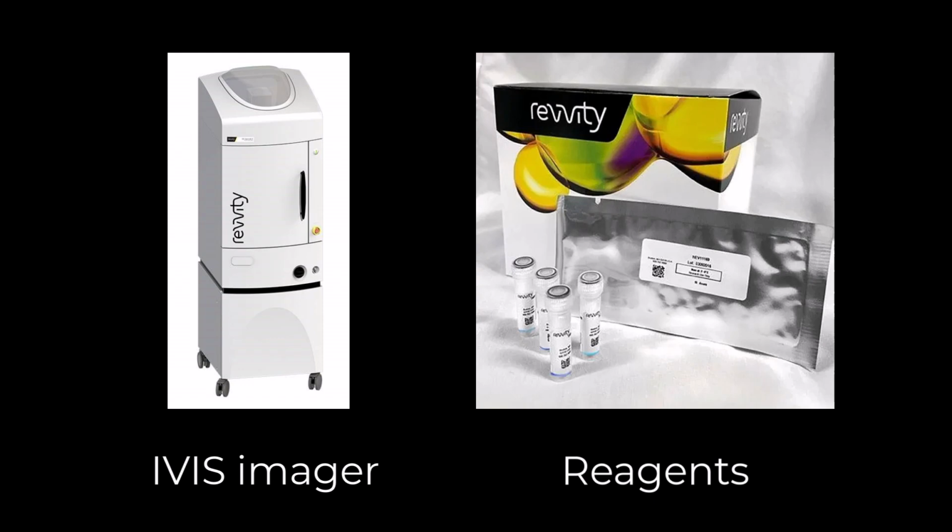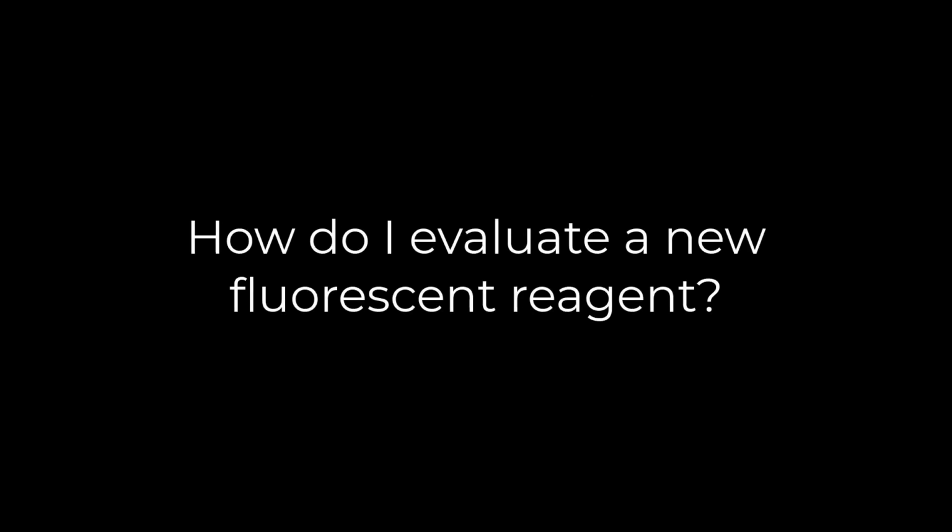In vitro pre-screening can also be an important precursor for successful in vivo fluorescence imaging. Here, we will guide you through preliminary assessment of fluorescent reagents using Revvity's IVIS imaging platform.